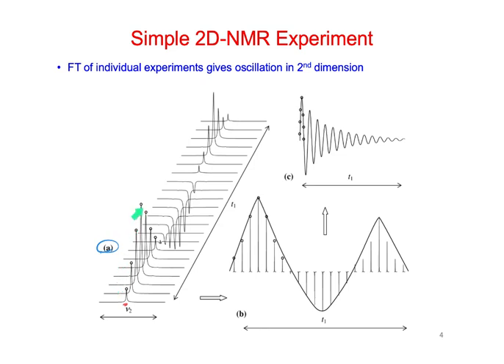Well, it's because as we're waiting and as this experiment is going on, we have these T1 and T2 relaxation modes going on at the same time, right? So some of it is relaxing up into the Z direction. That was the T1, and T2, remember, is fanning out into the XY plane. So those are happening at the same time as we're waiting during this increment. So that's why we get a loss in intensity.